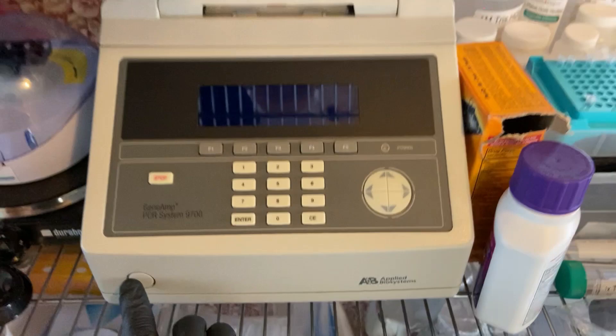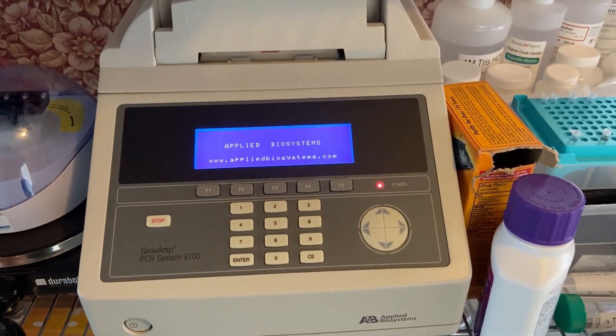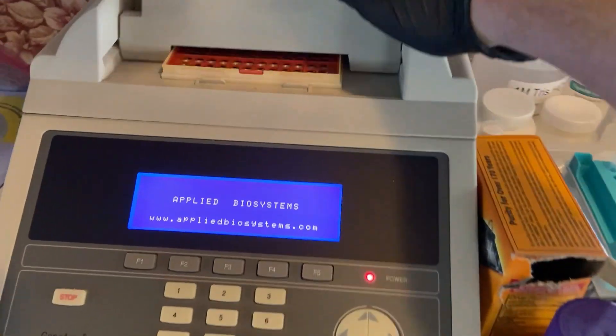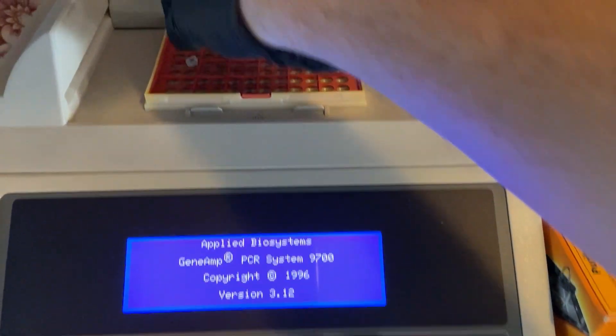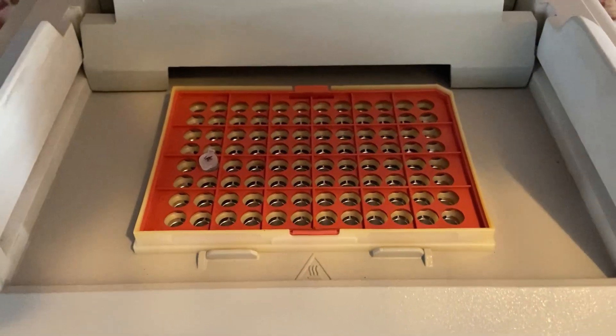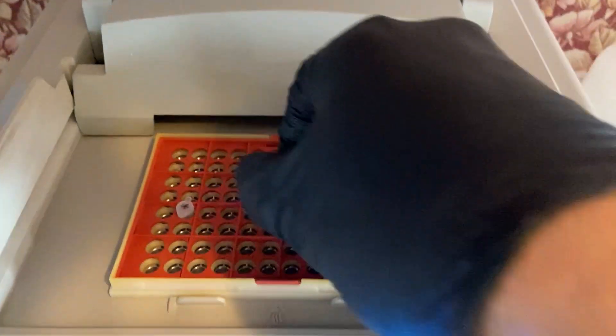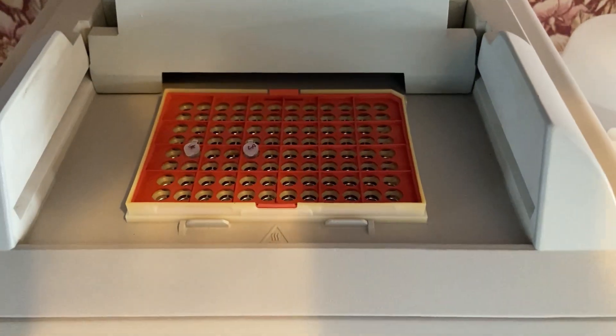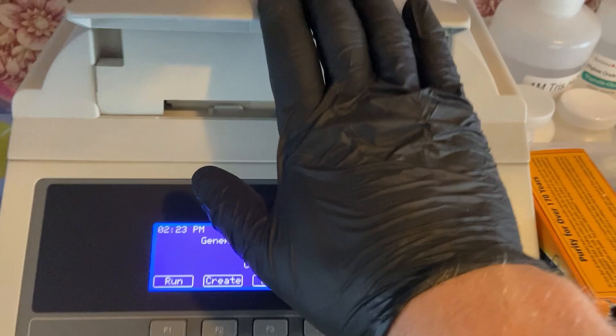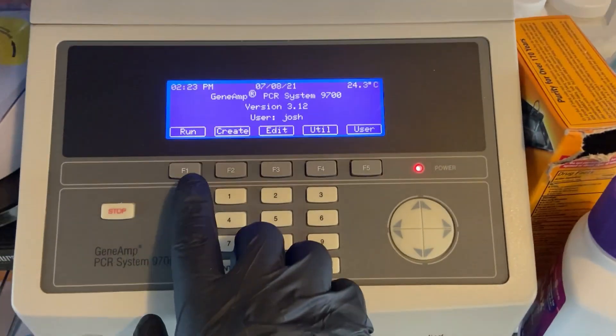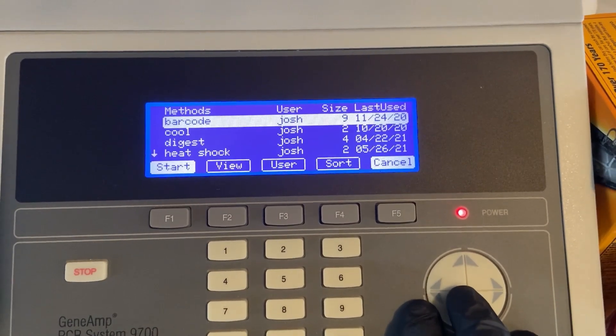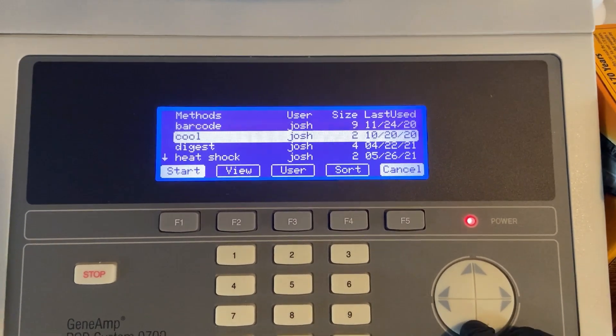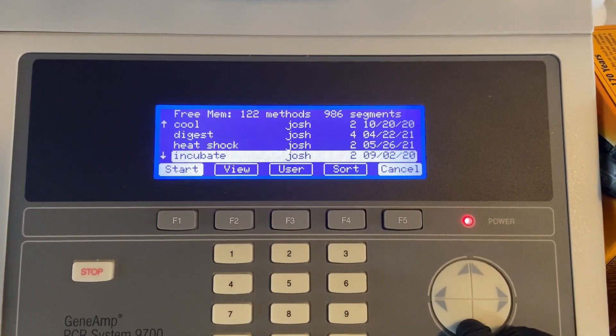So the next step here is we're going to move those microcentrifuge tubes to the thermocycler where we're going to allow them to incubate at 95°C for 10 minutes. After which we're going to centrifuge it for 5 minutes at 10,000 RPM. Or if you don't have a centrifuge that spins that fast, just extend the length of time that you allow them to spin so that all of the cell debris can collect at the bottom of the tube and the DNA can rise to the top.